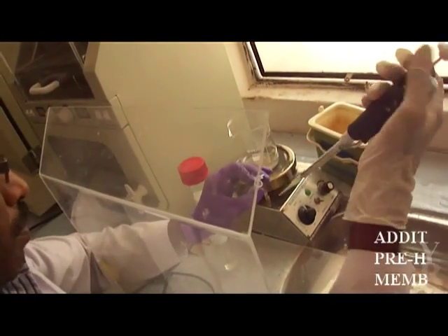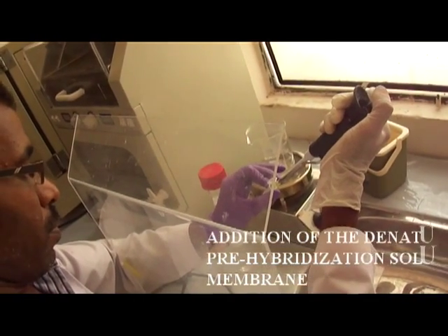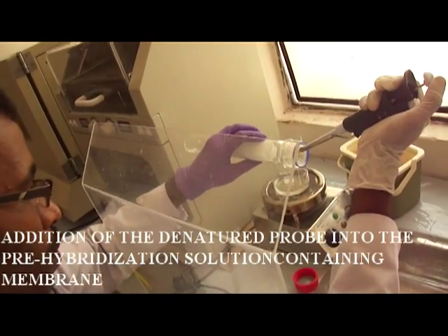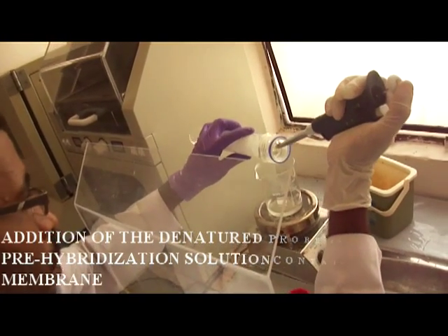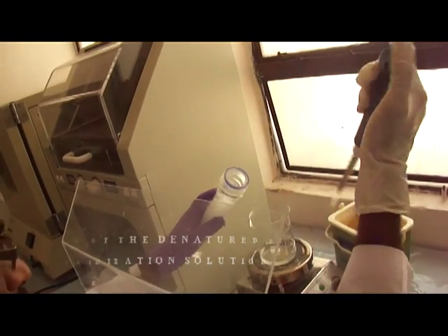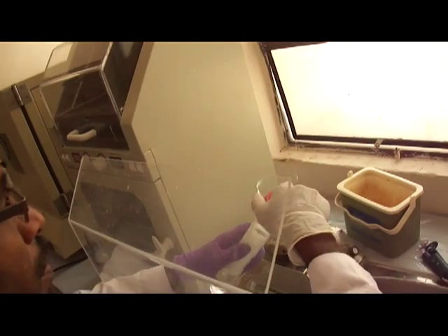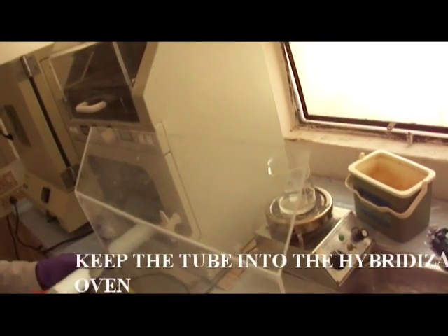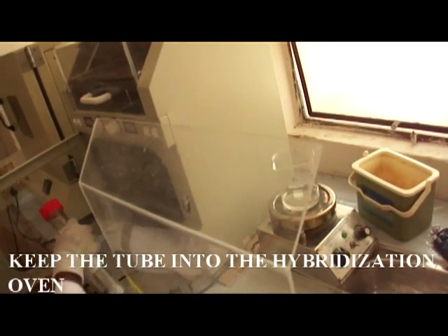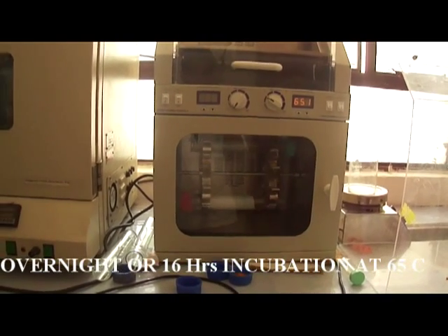Hybridization is an important step. Add the denatured probe into the pre-hybridization solution that contains our nylon membrane. Care must be taken that the probe should not be added directly to the membrane — it should be added to the sides of the tube. Mix the contents of the tube by gently shaking, and hybridization is done overnight or for 16 hours of incubation at 65 degrees Celsius temperature in the hybridization oven.